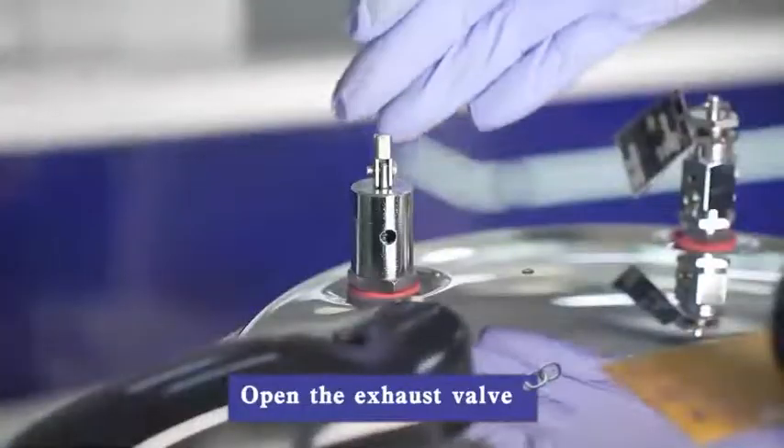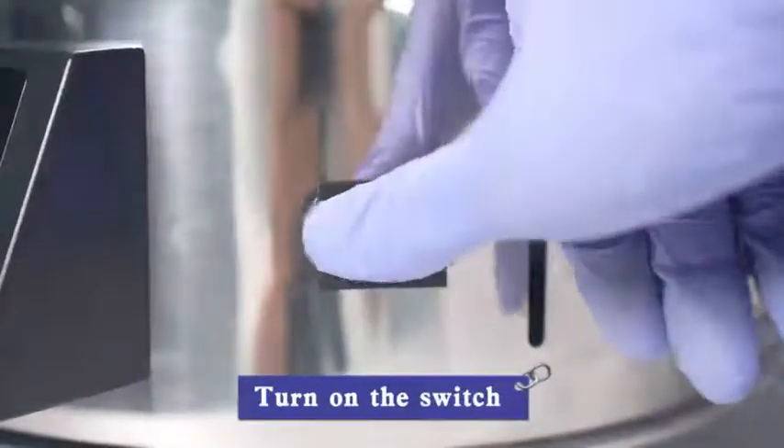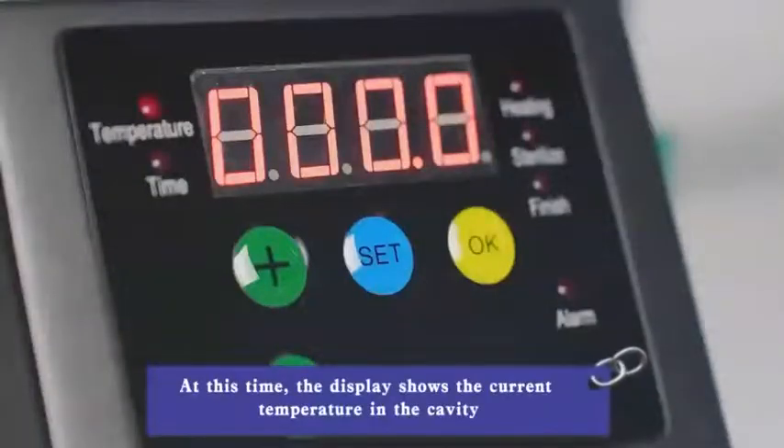Open the exhaust valve. Twist and snap the sealing cap. Turn on the power and turn on the switch. At this time, the display shows the current temperature in the cavity.